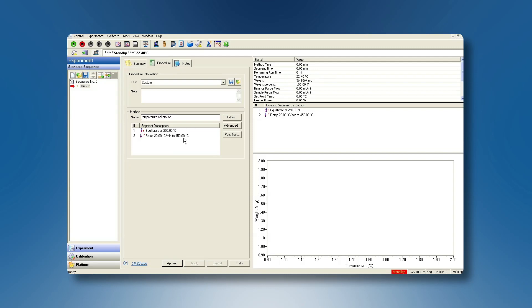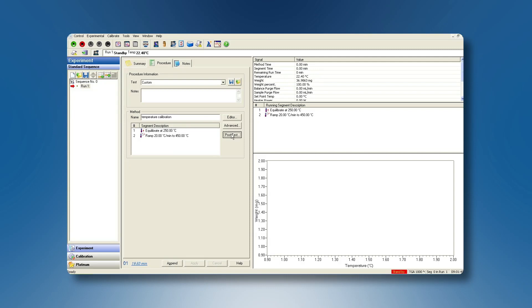Make sure that as post-test conditions, you choose furnace closed as method and conditions, since the magnet will be positioned under the furnace.